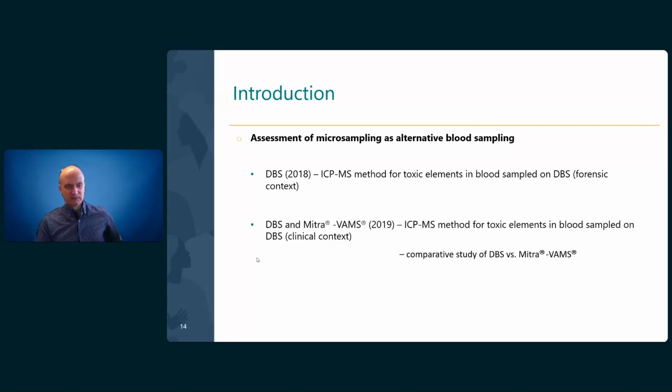Then 1 year later, we tried to improve the previous method and bring it to a level where it could be used in a clinical context. But we noticed a few limitations with the dry blood spot, especially contamination, poor reproducibility of the results, and other disadvantages. And at the time, I had a couple of Mitra VAMS devices here in the laboratory, and I asked the student who was working on a summer project to test those VAMS devices to see how they work.